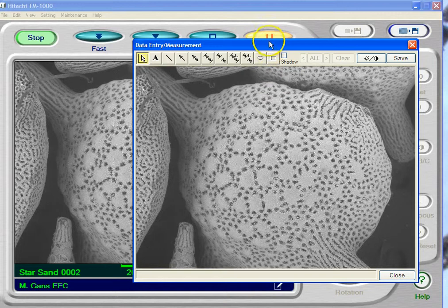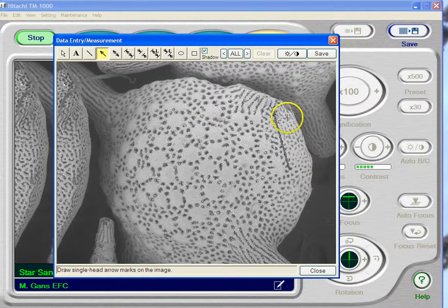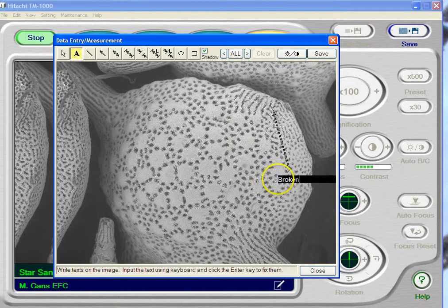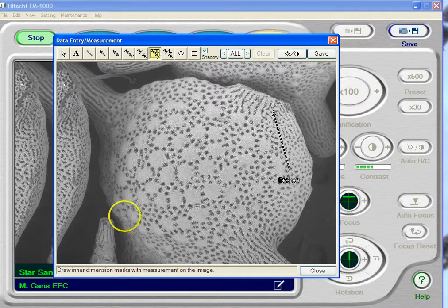It's going to pop up a screen — it's the same picture. I'm going to click Shadow, because that adds a shadow to the look. You can put in text, lines, and arrows. For instance, I'll put an arrow in here and add some text that says 'broken.' But the cool thing is, I can also make measurements. This says L, which is a length — measuring inside to inside. Or L measuring outside to outside. So let's say I want to measure how far it is across this foraminiferen. I'll click and drag all the way across, and it tells me that's 1.22 millimeters, which is pretty cool.